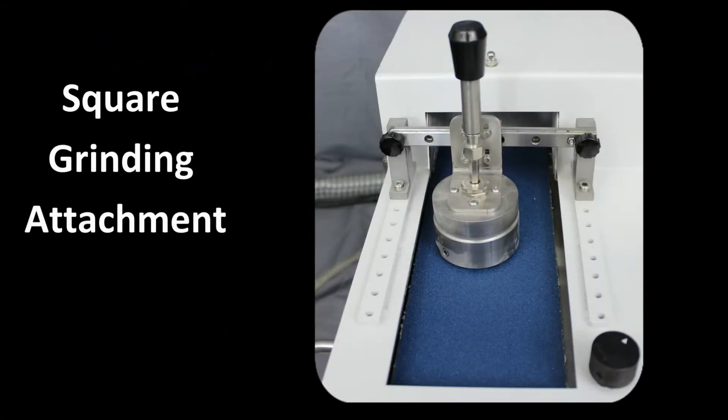The square grinding attachment is attached to the Penta 7500 to hold the mounted specimen square to the grinding belt. It is spring loaded so that additional force can be applied to grinding the mount.